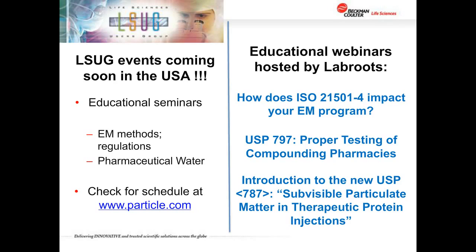It's a matter of what's been needed in terms of cleanroom. But if you're talking about the air in the cleanroom and the particles in the air, the concentration of it, this can be used for that. And it's not a matter of it being sterile or not sterile. It's a matter really of, do I want to control the level of airborne particles?